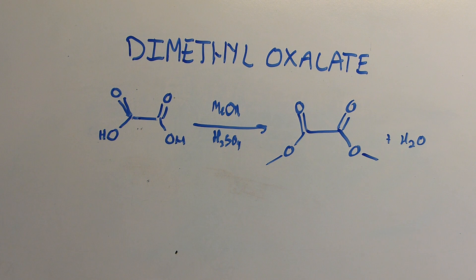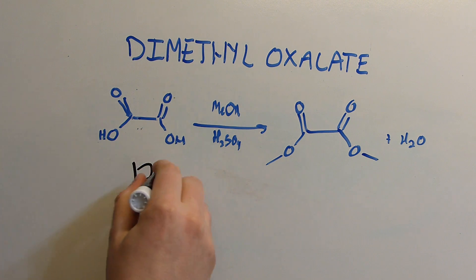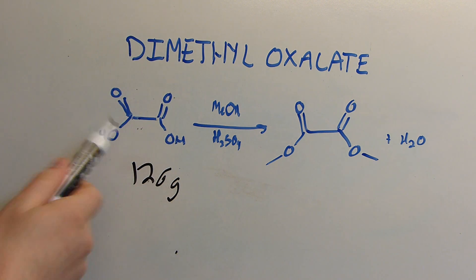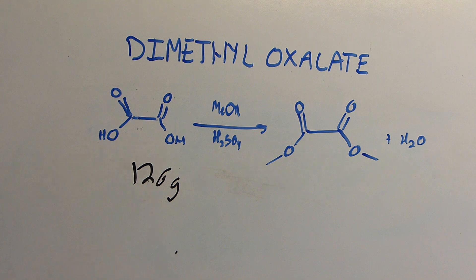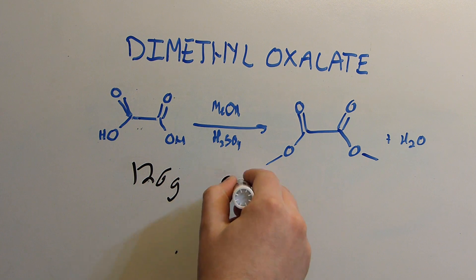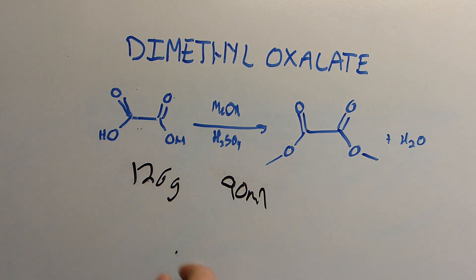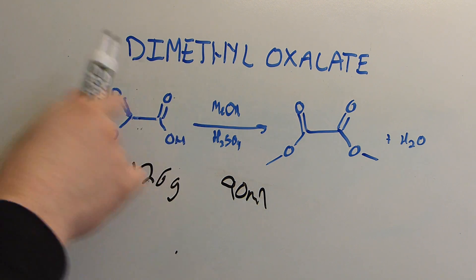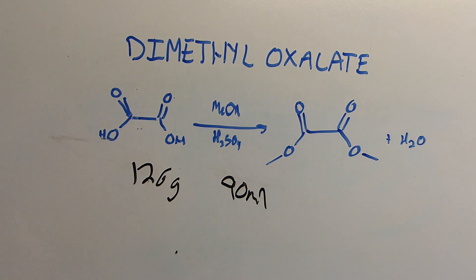I'll be performing this reaction on a 1 molar scale, which means that I'll need 126 grams of oxalic acid. Now this doesn't add up to 126 because commercial oxalic acid is sold as the dihydrate. So 126 grams of oxalic acid dihydrate, and we'll add 90 milliliters of methanol, which is slightly excess of what we need. However, it will help to drive the reaction to completion and prevent any extra oxalic acid from being left in solution, which will help us clean up the products later.